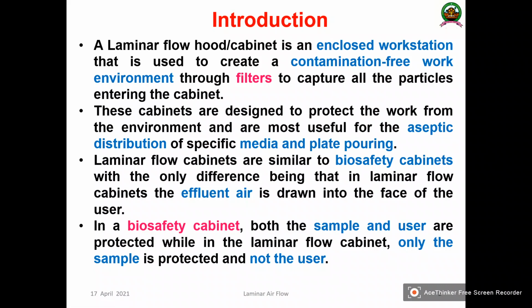So this is a specifically made cabinet that can be used for a variety of sterile aseptic procedures, and that is commonly used in microbiological laboratories. And these cabinets are designed to protect the work from the environment and are most useful for the aseptic distribution of specific media and the plate and all the aseptic work that is happening in the microbiology laboratory.